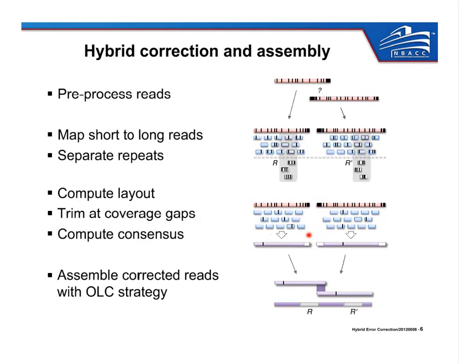Once we have the trimmed reads, we take the second generation, either 454, Illumina, or even PacBio CCS reads, and we compute a consensus sequence for each of the PacBio reads. So all of the PacBio reads that go in have a little mini assembly constructed for each of them. A consensus is called for every individual PacBio read, and the output of that correction is a collection of highly accurate and corrected PacBio reads.